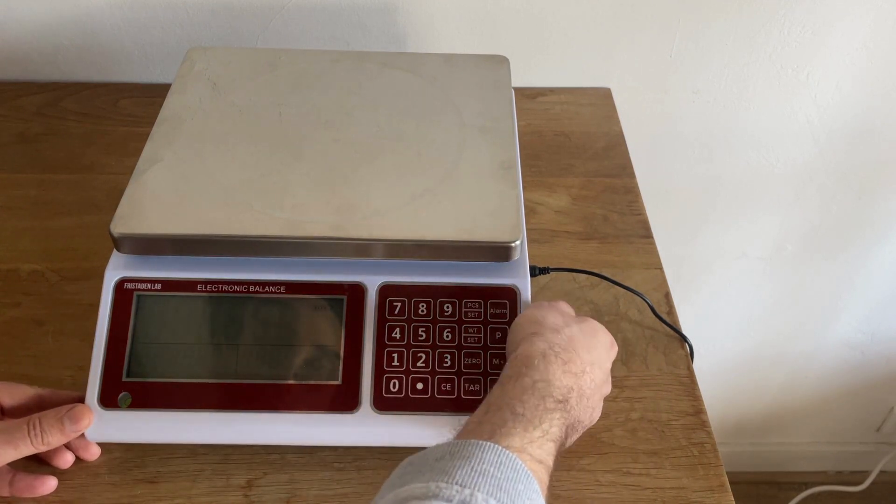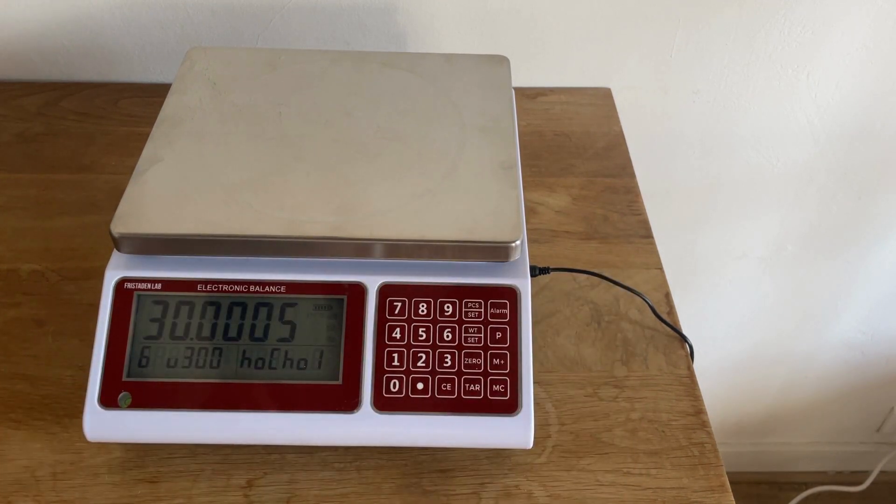To begin, there's a power button on the lower right-hand side. You turn it on and it just takes a couple seconds to warm up. There's no extended warm-up time compared to a precision balance. It's been calibrated at the factory and you can use it right out of the box.